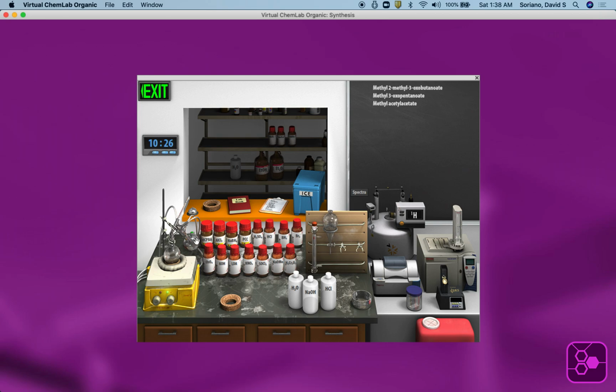And what temperature are we at? We're up to 170. There's the pot mixture. There's the collection flask. Eventually, when the reaction is done, when we're done distilling, it will, of course, shut down.